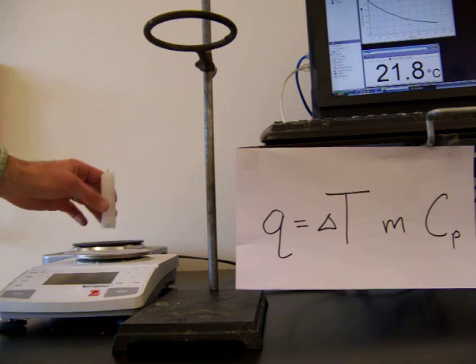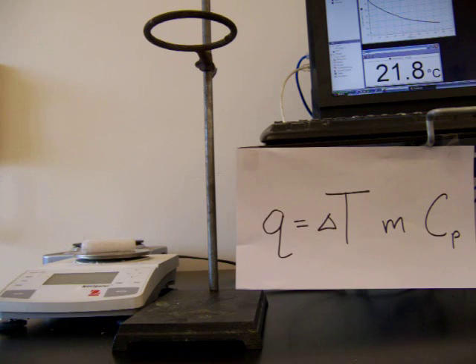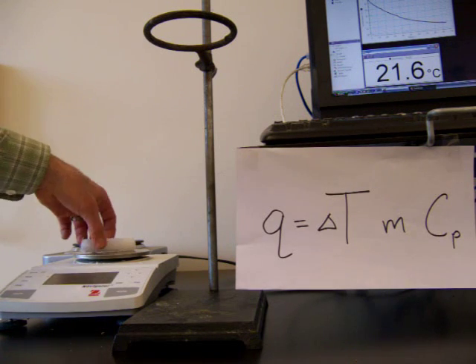First thing I need to do is find the mass of my candle. So I'll set the candle on the balance, and we have an initial mass of 21.37 grams.